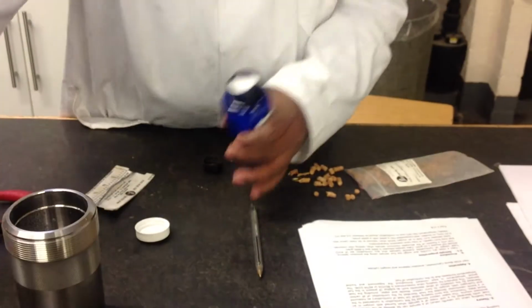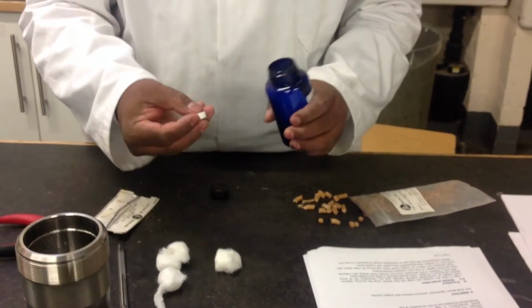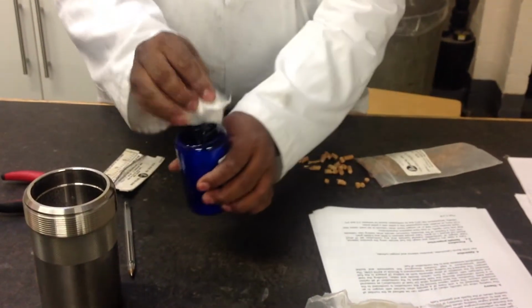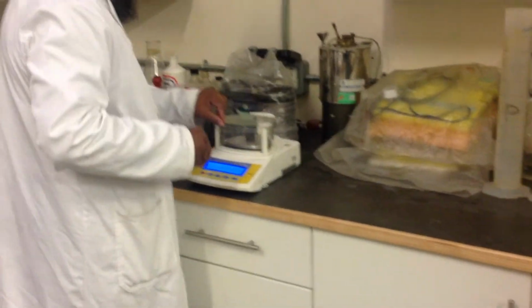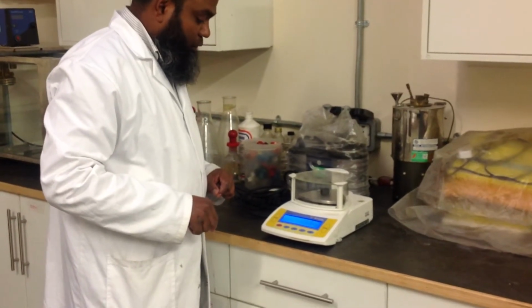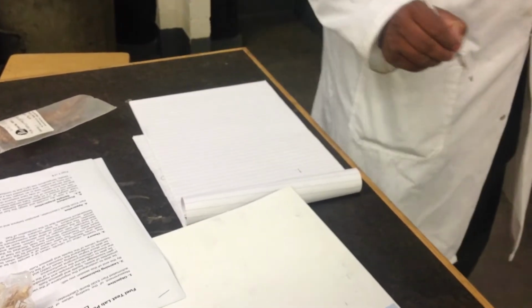And then we take a fuel sample. Here we are taking one sample of fuel, which is a type of biomass. This is the sample. We are putting this sample here and taking the crucible with the sample to the balance again. And then here we can see the net weight, which is 1.059. So we need to keep a record of this weight, 1.059 gram.